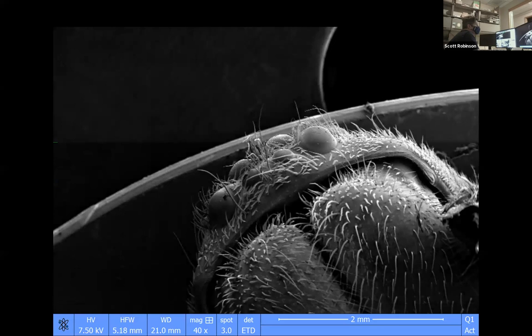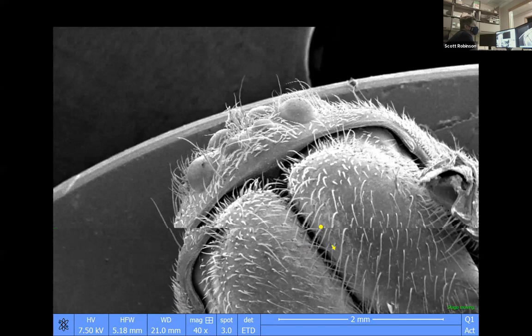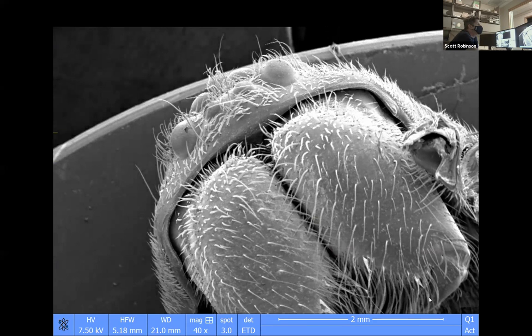Speaking of spiders, we can see six of its eyes, and then we can see the chelicerae right here, these great big things, and those will move apart. Below them are the fangs, and unfortunately, we can't see the fangs very well.